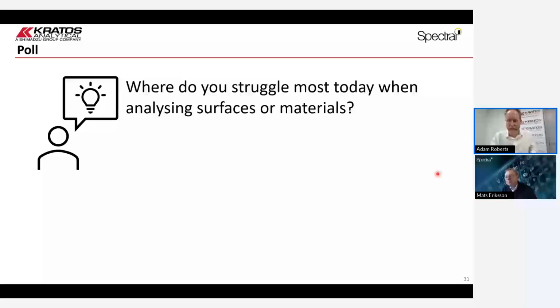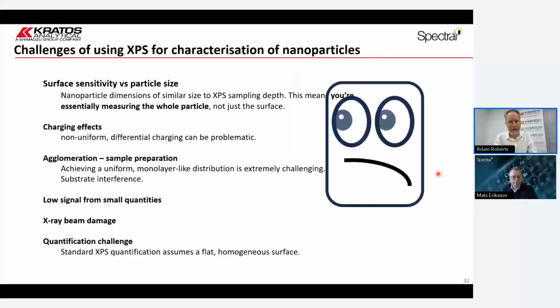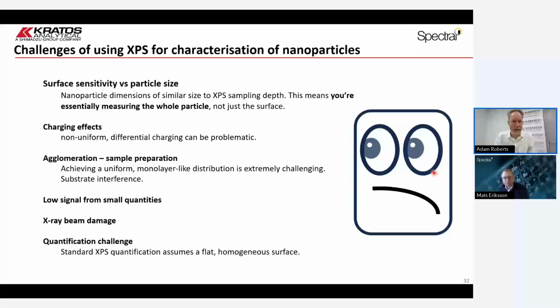So I think our final example, we're coming towards the end now. Now we're going to really push the capabilities of both XPS and SEM. We're going to spend maybe 5 minutes looking at nanoparticle materials. Conventionally, XPS is beginning to get out of its comfort zone. There are challenges of analyzing nanomaterials with XPS.